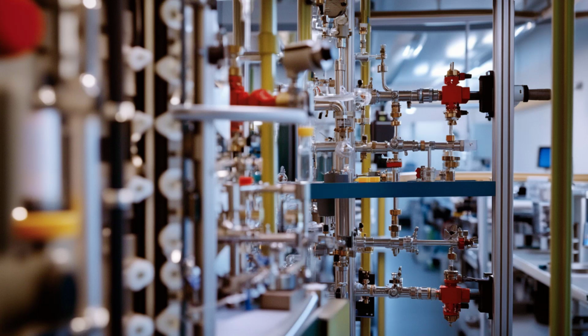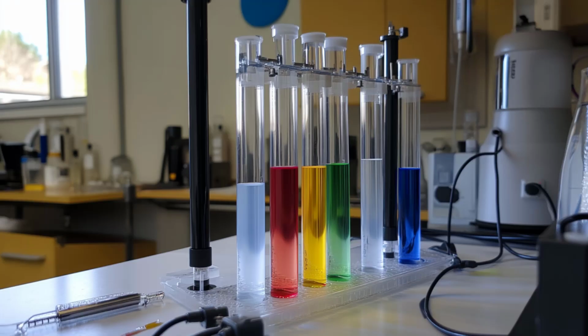In LC, it consists of finely packed solid particles such as silica or chemically bonded phases, with specific properties tailored to interact with the analytes. The mobile phase is the medium that carries the analytes through the stationary phase. In GC, it is an inert gas, ensuring no reactive interference. In LC, it is a solvent or solvent mixture that can be adjusted to optimize the separation based on the analyte's polarity or other properties.